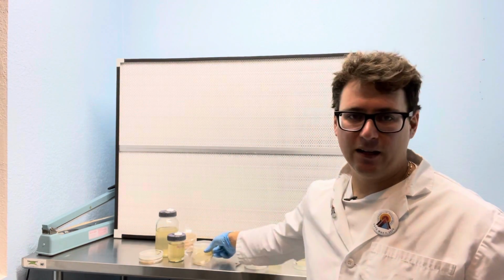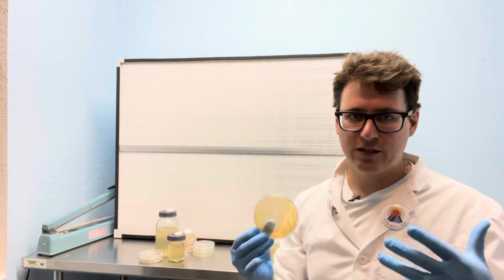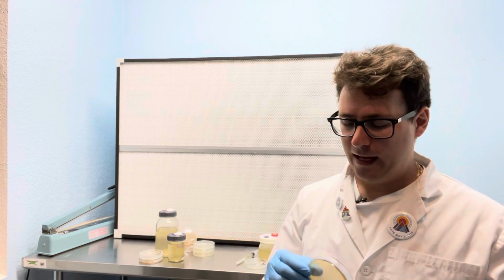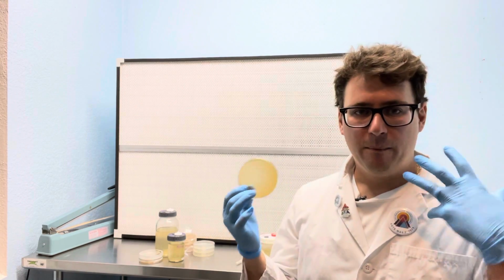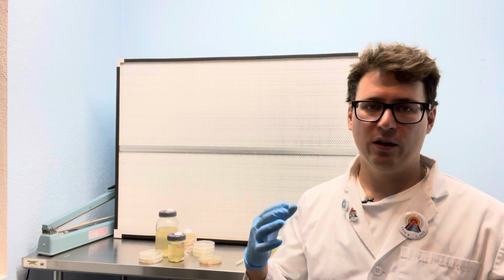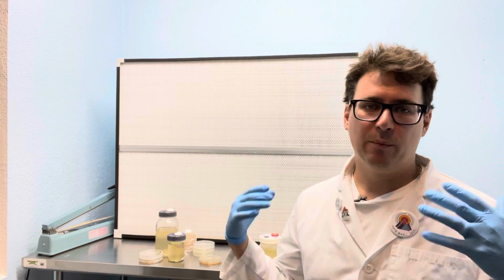So that leads us to agar. What is agar? This is a petri dish with MEA, or malt extract agar, and it's a gelatin solution derived from algae. You mix it in a solution and bring it up to a boil so it completely dissolves, and then we sterilize it in a pressure cooker or an autoclave for 20 minutes at 15 psi or 250 degrees Fahrenheit.